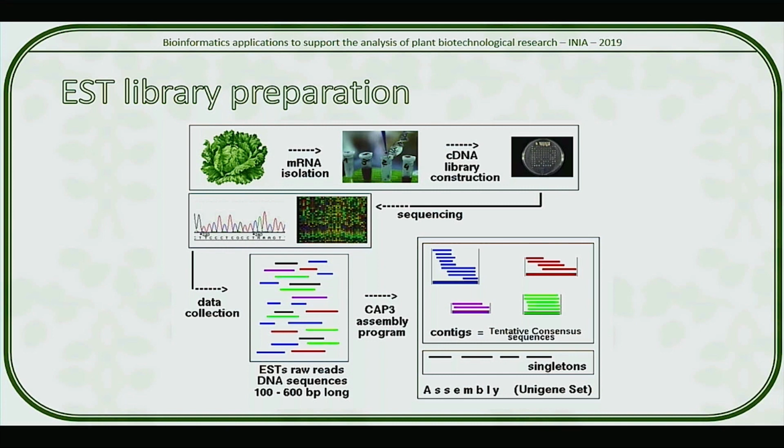But it's not that simple. The usual output from these CAP assembly programs from ESTs is singletons. Sequences that didn't have much extension to do, because you just couldn't get any overlapping information from that. You would have to go very deep sequencing into these EST libraries to actually get some accurate reconstruction of contiguous sequences.